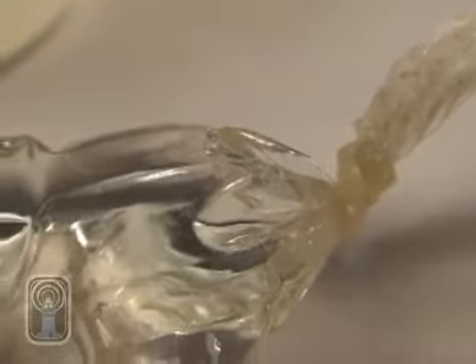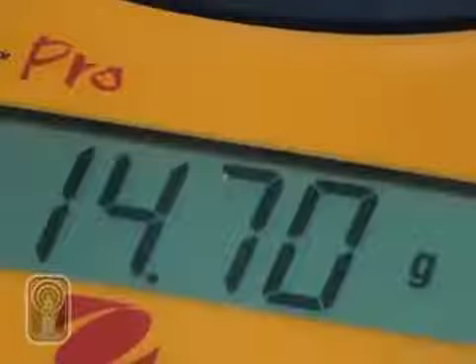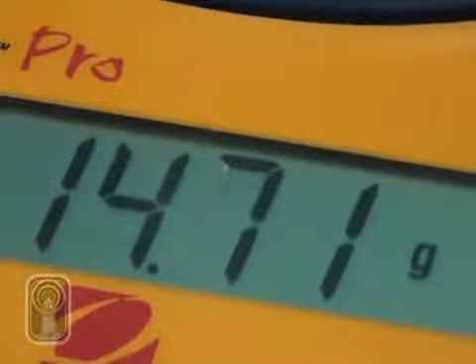The second end of the tubing was also twisted, making sure that no air was in the cell. An orthodontic rubber band was used to secure the second end as well. The completed cell was weighed on a digital balance and then was gently placed in a beaker of tap water.